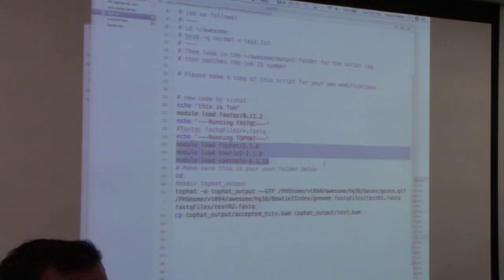The third part of the homework, for those who find that this is not enough, is to load the BAM files on IGV. That's the extra credit, if you can figure it out. Load them into IGV and compare the TopHat alignment to the STAR alignment for your gene of interest and tell me if their read profiles look different.